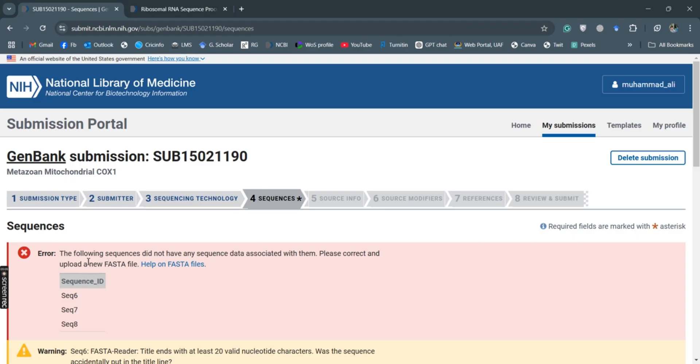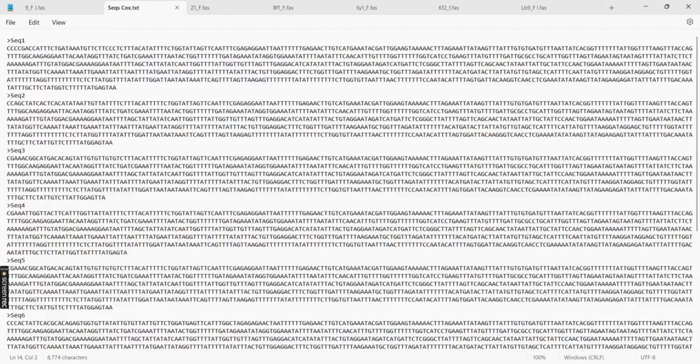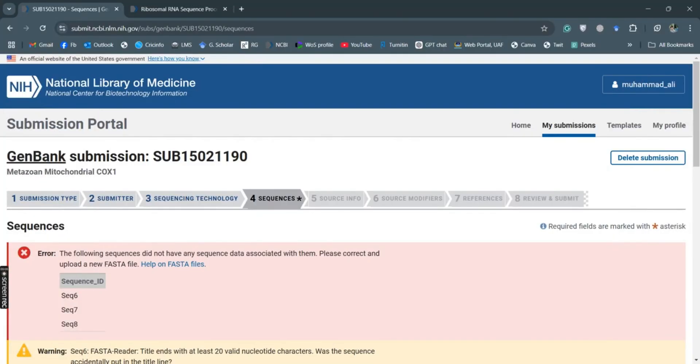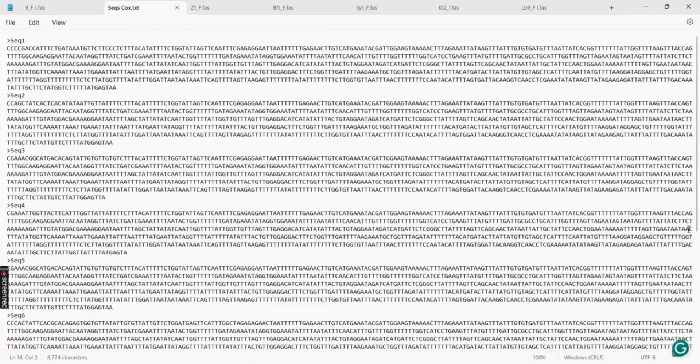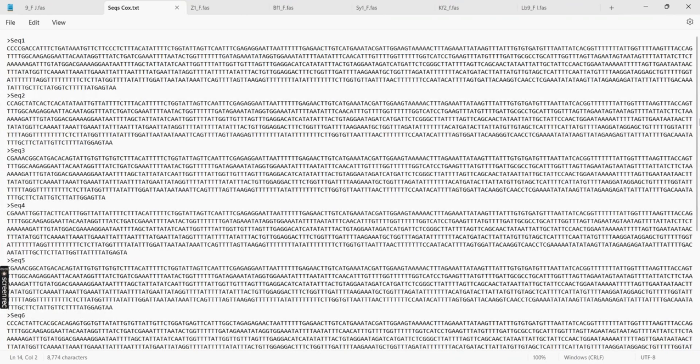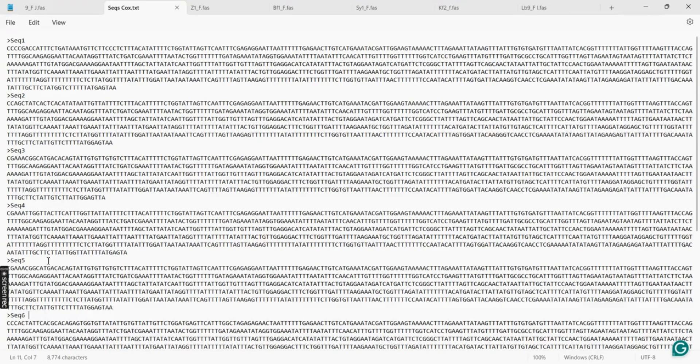So it says that the following sequences do not have any sequence, so I will correct this file. So what are these sequences? Six, seven, eight. So I will click on six, seven, and eight. Yes, I need to backspace.